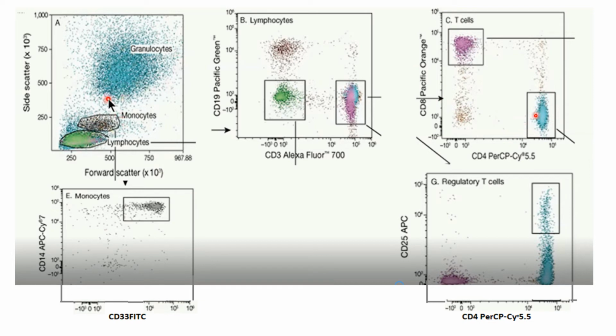These are the CD4 positive T cells, meaning helper T cells, and these are the CD8 T cells, that is, cytotoxic T cells. Now the CD4 T cells we can analyze further for two markers: CD4 and CD25.